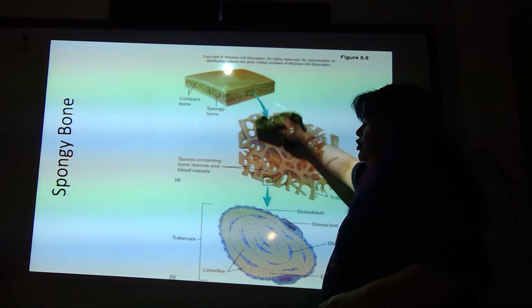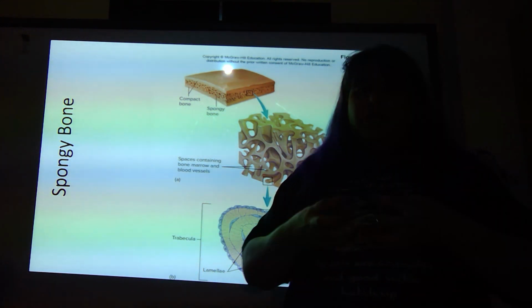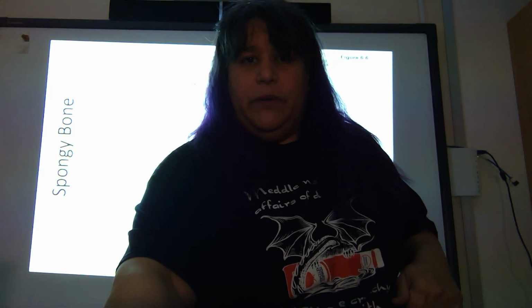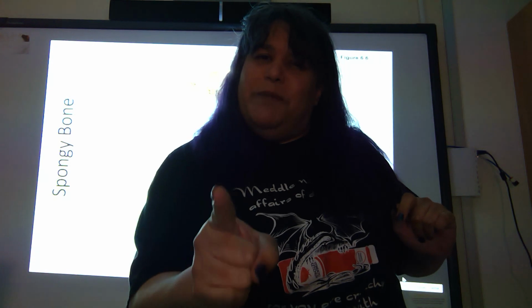So that's spongy bone. And when you see a spongy bone, it looks like this. It looks porous. Now, compact bone, that is the wrong computer.